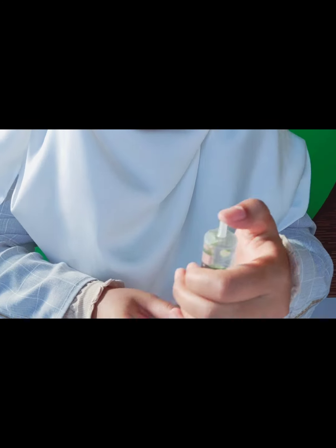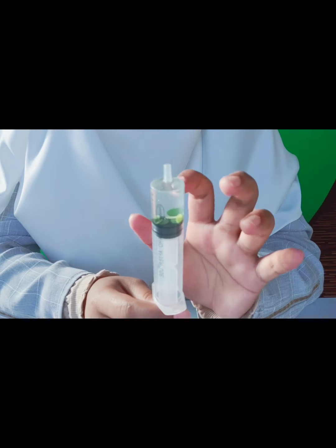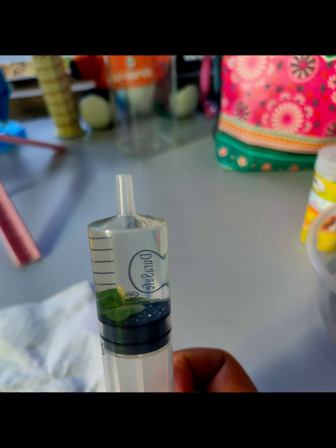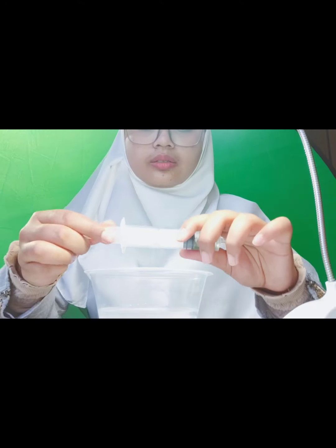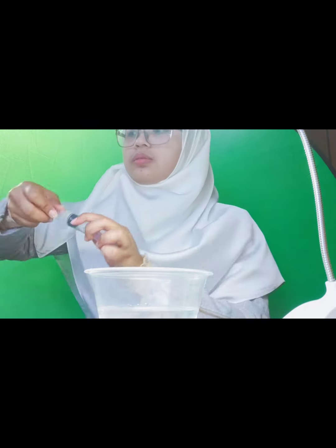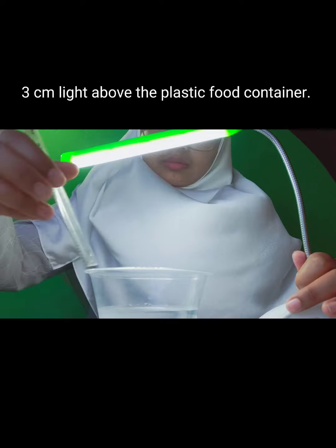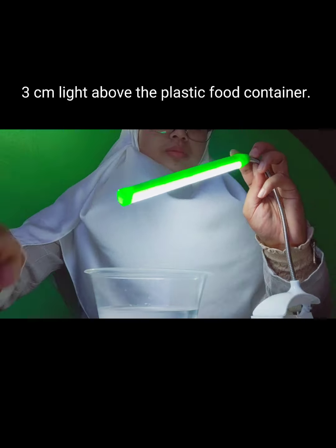We pull the plunger to create a vacuum for a few seconds and release the plunger, letting it snap back, until there is no air in the syringe. After there is no air in the syringe, we put the leaf discs back into the solution of sodium bicarbonate and we measure with a ruler 3 cm for the light above the container.